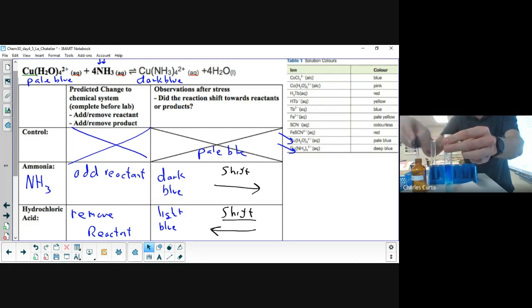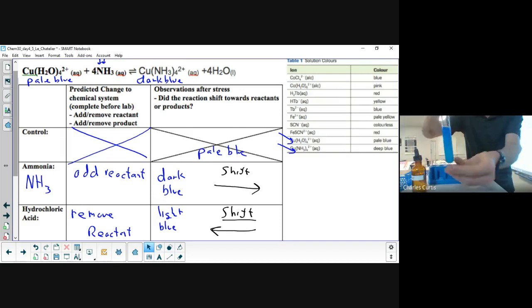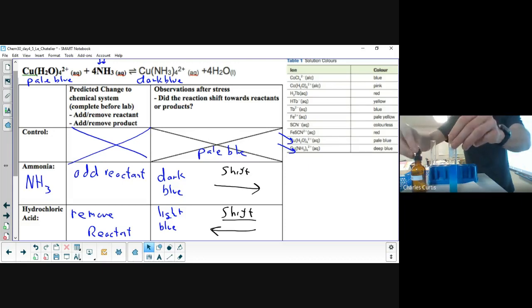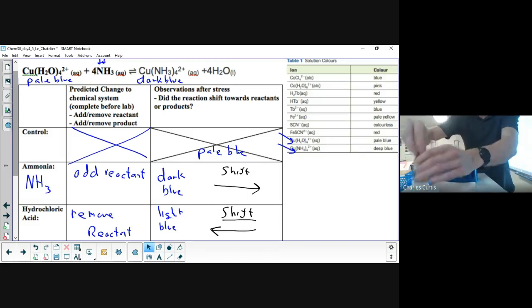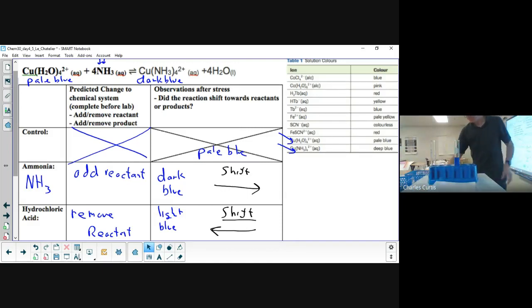It's not just a shift once. It'll shift over and over again. Now my volume keeps going up and up. I have to use up all that hydrochloric acid to get the shift. And there is our dark blue forming. Probably just needs a little bit more ammonia to get the whole thing really dark. Okay. So that is our lab.